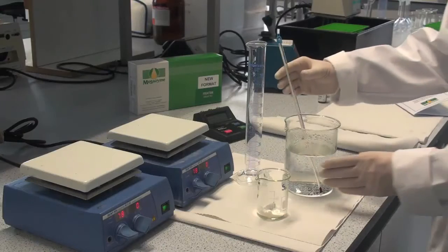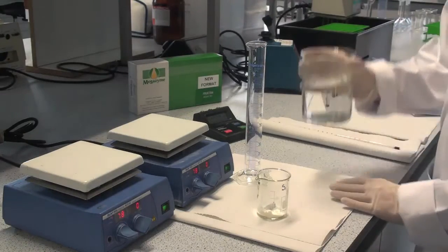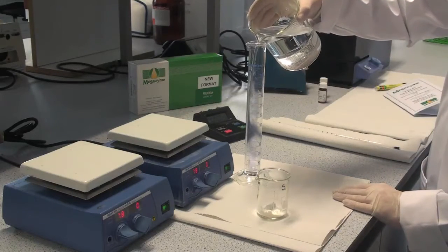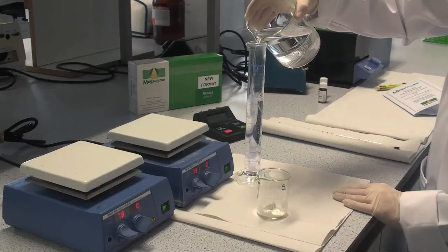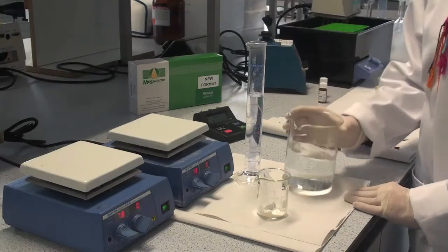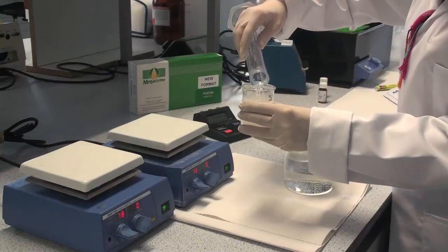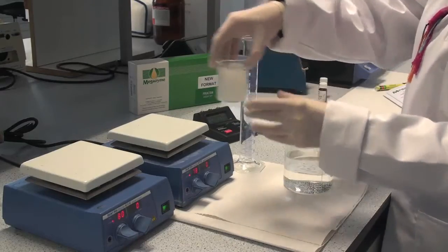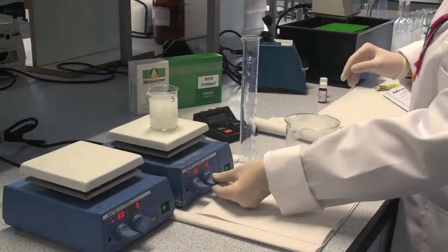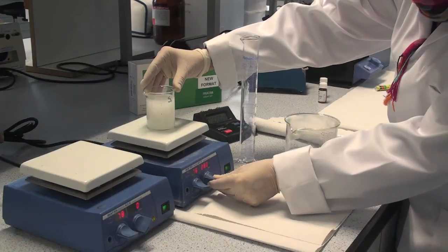To samples of 1 gram, add 80 ml of hot distilled water at approximately 80 degrees centigrade. Place the beaker on a hot plate magnetic stirrer and stir with heating at approximately 80 degrees centigrade for 15 minutes or until the sample is completely dispersed.